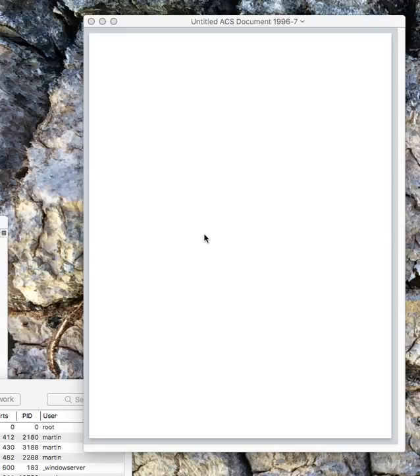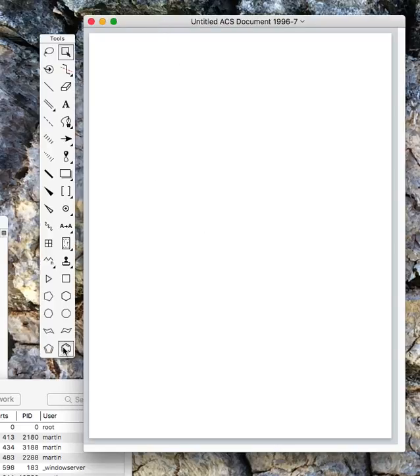This is just going to be a quick introduction to how to use the new Hotkeys feature of ChemDraw 2017 to draw a quick reaction scheme. Now I'm going to try and use as few clicks and trips to the drawing palette as possible.